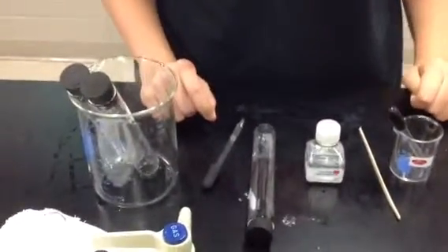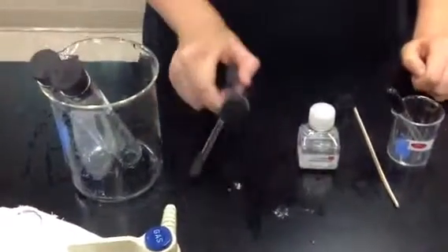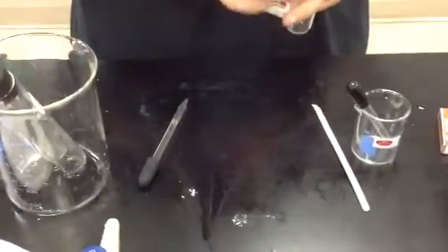Now we have the three test tubes and we're ready to conduct our three tests. The order of the test is: first, conduct the test for lime water. To conduct the lime water test, take lime water in a dropper.